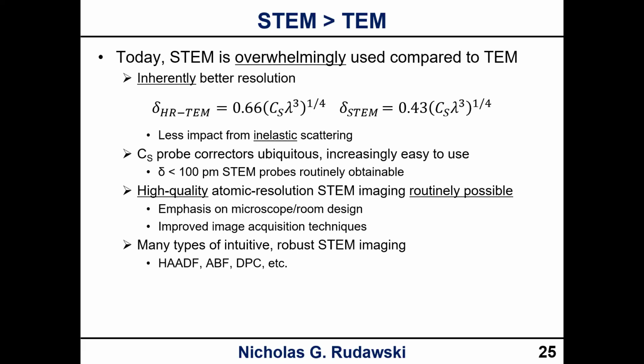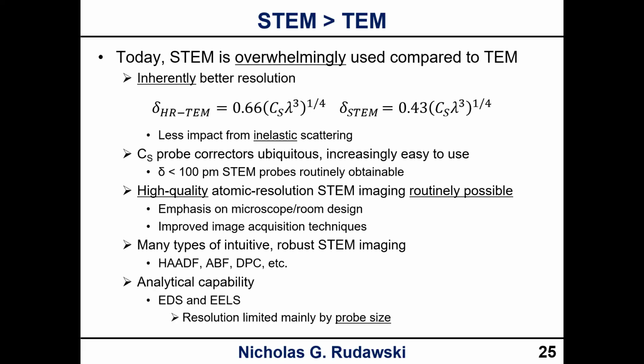So HAADF was, or still is, the most popular, but there's a bunch of other ones, as we're going to see here. And when we add on to this the analytical capability with EDS and EELS that we can do in STEM mode, and the resolution that we get from that, which is limited mainly by probe size, STEM clearly has overtaken TEM.